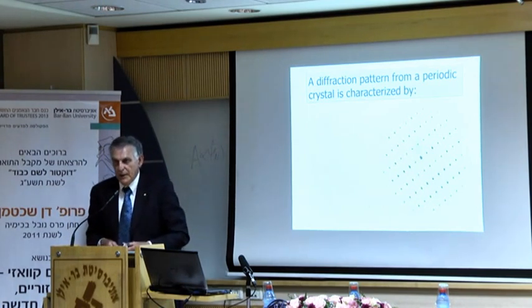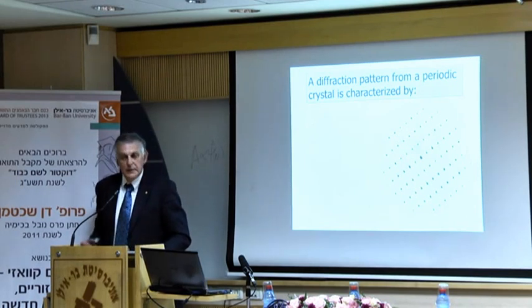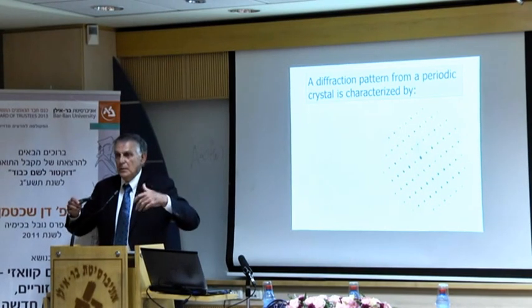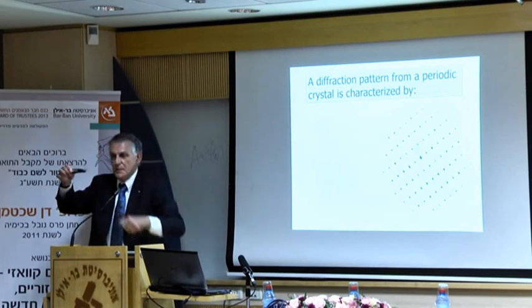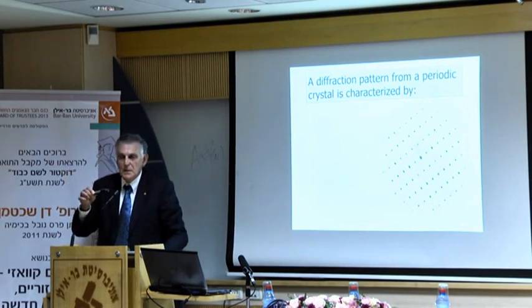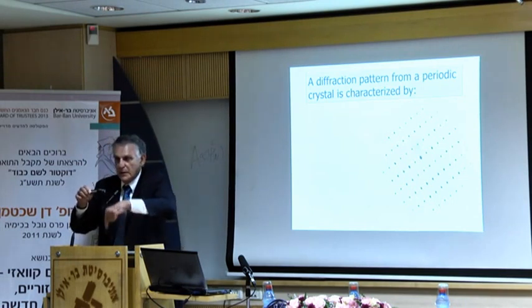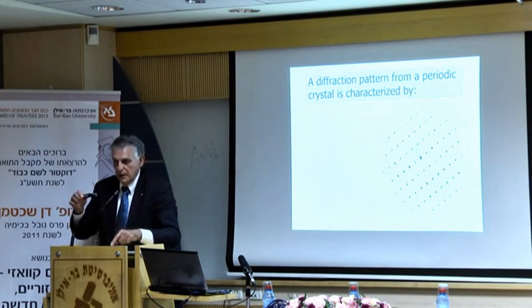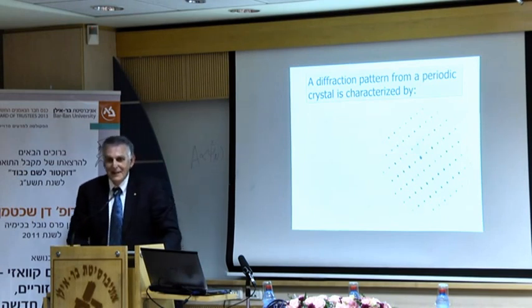What do you do in an electron microscope? You have an electron beam that comes, an accelerated beam. What's the acceleration voltage? About 200,000 volts. It comes down onto a specimen. We make the specimen very thin, so much so that the beam can go through the specimen and hit a phosphor screen at the bottom of the electron microscope. Have you ever seen a phosphor screen? Anybody? Television? Cell phone? Yeah. Okay.